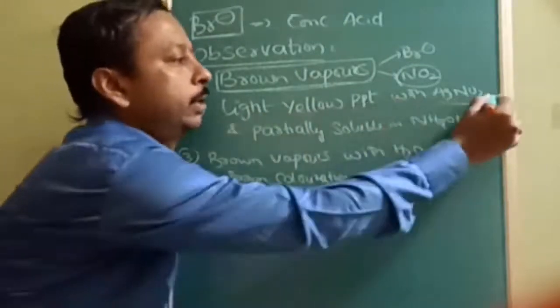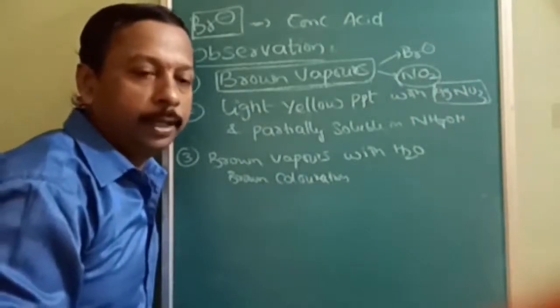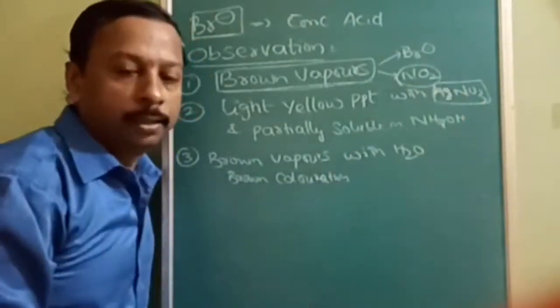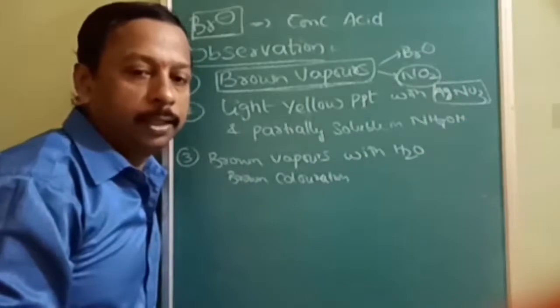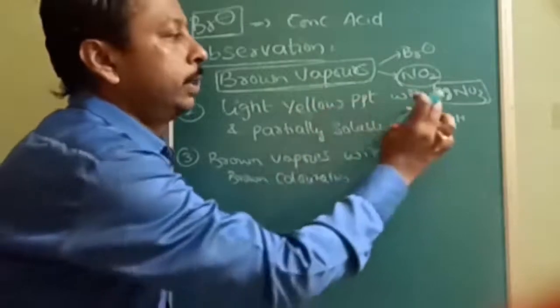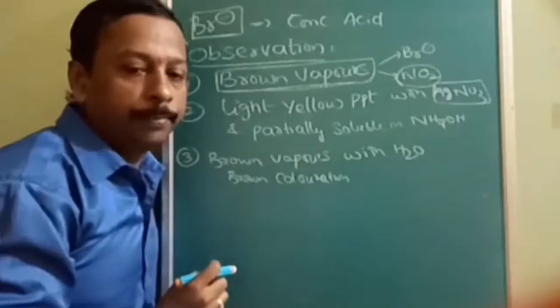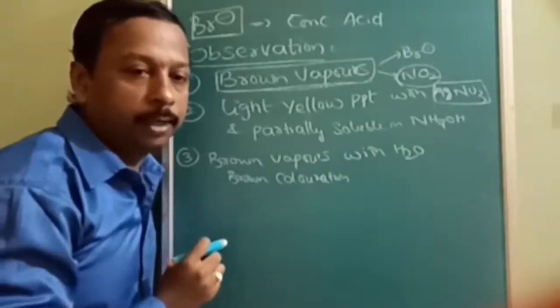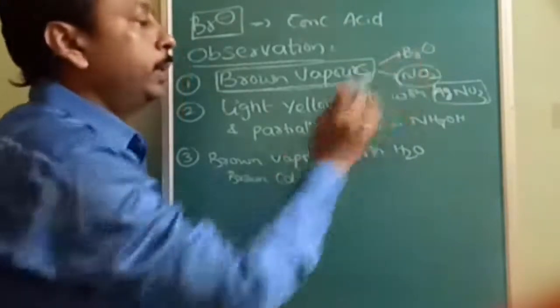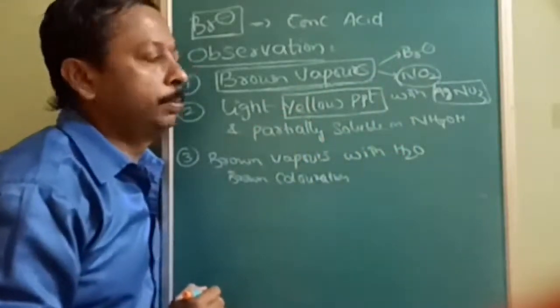When treated with AgNO3, a similar test is done for which acidic radical? Reaction with AgNO3 test is already done with one of the acidic radicals. To identify which acidic radical is AgNO3 added? Very nice, Cl minus. If chloride is there, AgNO3 is added, and you will get a white precipitate observation. But if Br minus is present, in place of the white precipitate, we will get a light yellow precipitate.